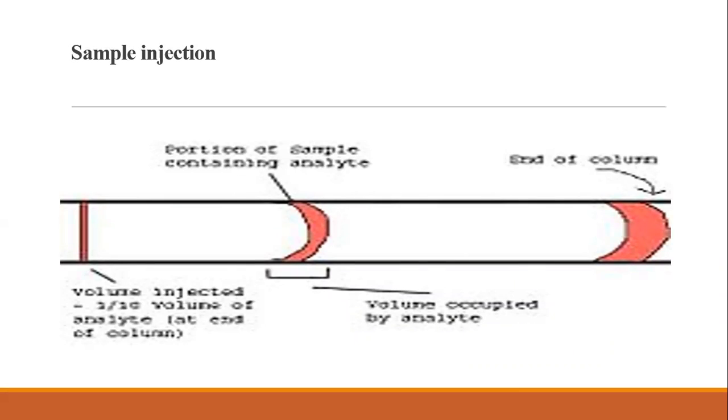Next, let's move on to the sample injection.